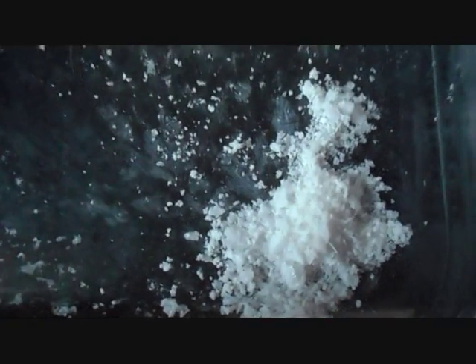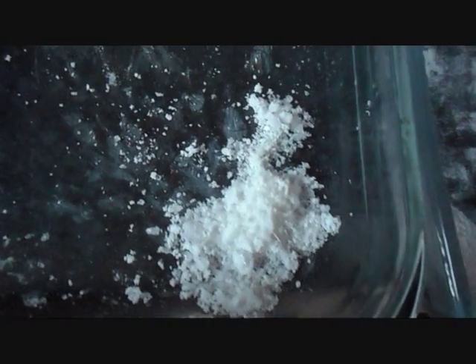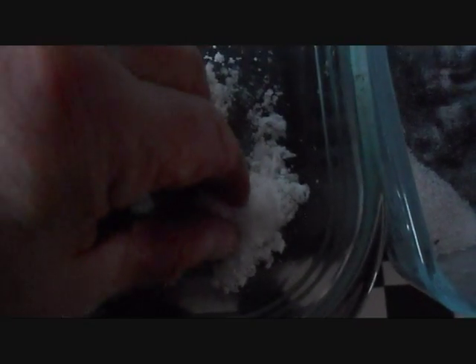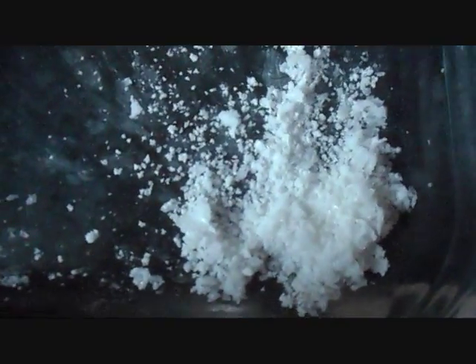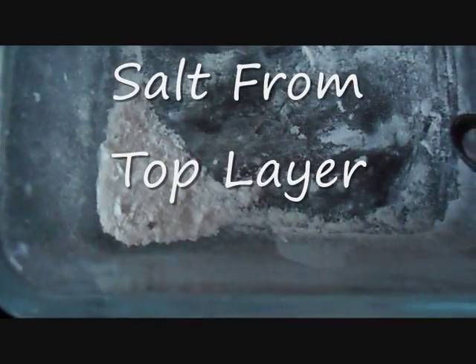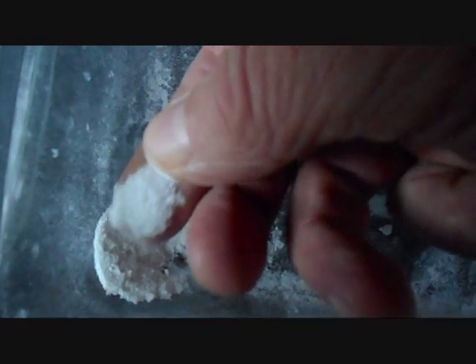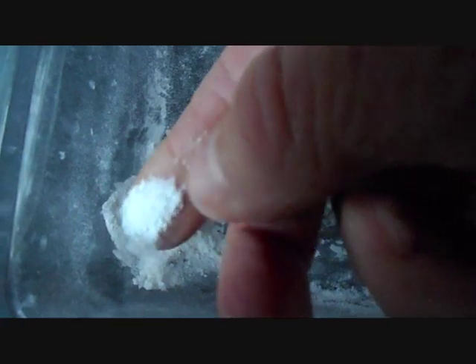Okay, so I've got 2 salts out of the mix, this experiment. This one is a sort of very, very crystallised salt. This came from the clear liquid that was underneath the oil, and this was like a snot that was floating on top of the oil, which is actually lighter than the oil. I don't know what it is, but it formed this very fine powder.